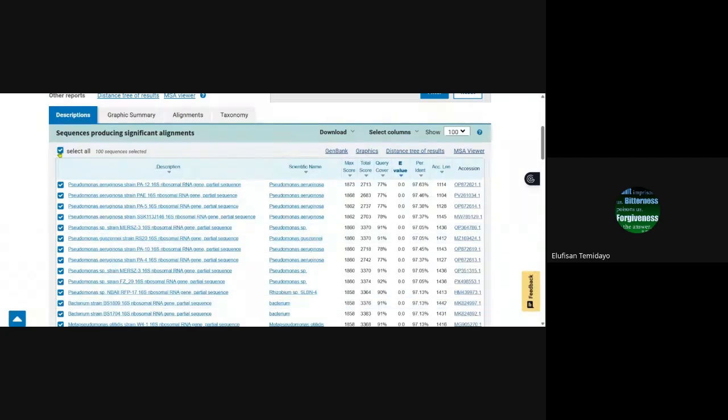So what I'm going to do is I'm going to unclick this place, and then I'm going to select my FX10. 1, 2, 3, 4, 5, 6, 7, 8, 9, 10. Then this one plus this one, 11.